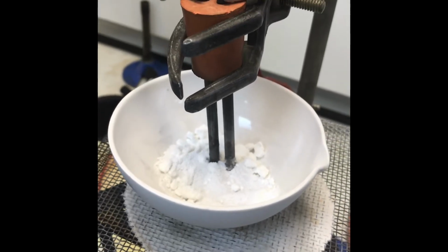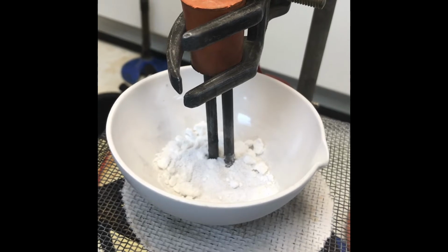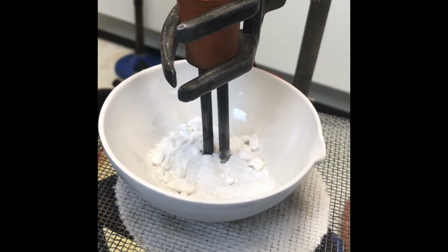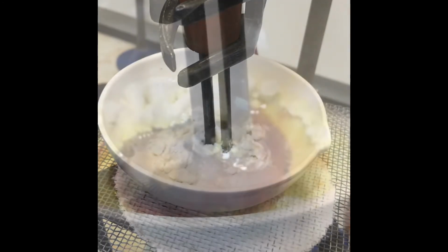It will complete the circuit. We would expect the bulb to light and the compound will break down. In this case the compound breaks down to produce metallic lead and bromine.